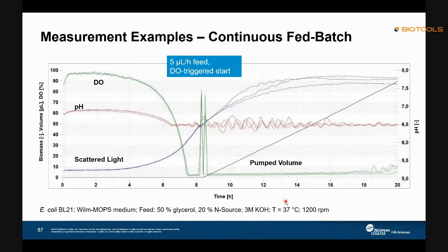And we talk about how we can continuously add the sample, adding the material in the reservoir. So this is about continuously adding the sample and what the changes will be. And we can see that the DO will drop suddenly and the biomass is getting up. So most likely it is using up some of the DO for the increase.